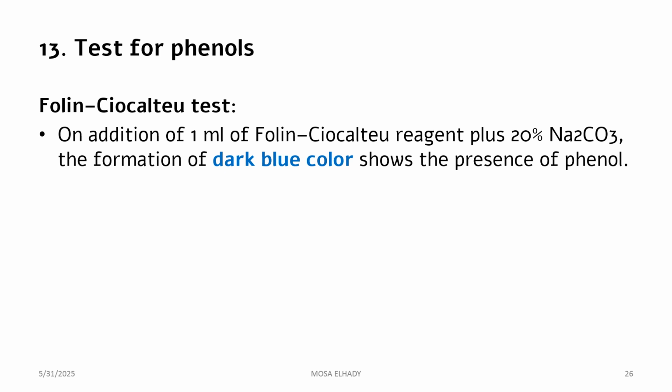The third test for phenols uses the folin-ciocalteu reagent. In this test, we add 1 ml of this reagent and we add 20% sodium carbonate, and the change of color to dark blue also indicates the presence of phenol in the extract.